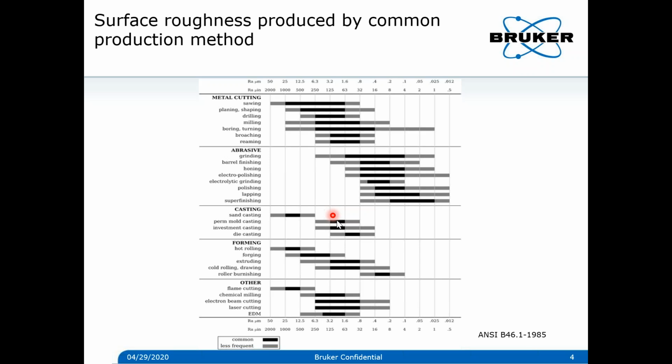Okay. Thank you. So let me read out the second question. The second question is asking about leveling of the raw data. Will leveling multiple times increase the error? Typically, you don't have to do the leveling multiple times. You need to select the proper points to do the leveling. If you have a very randomly varying surface, you can even enlarge your selection. That means for each of them you can average the left and right selection. So you don't need to do multiple times leveling.